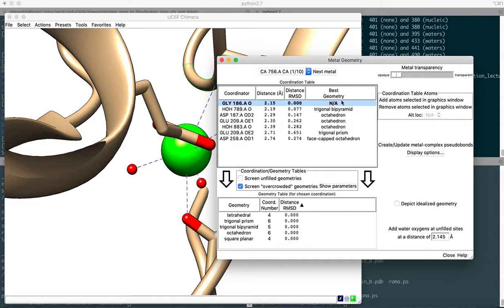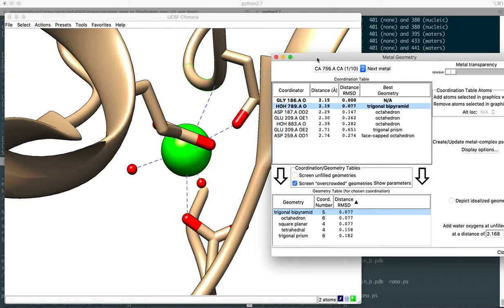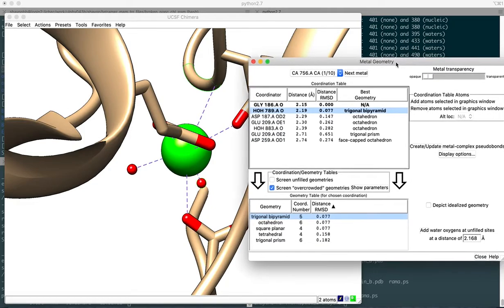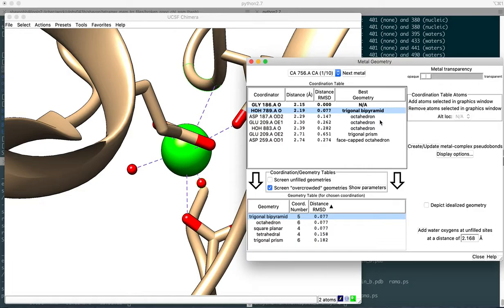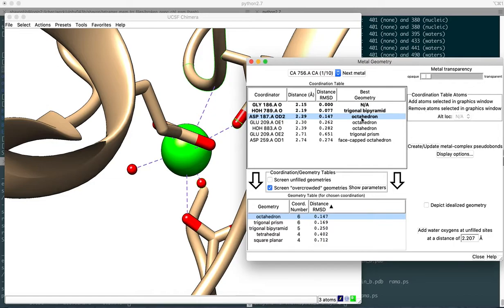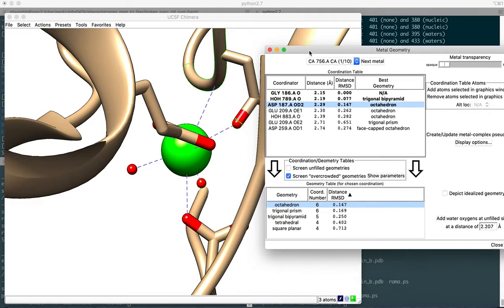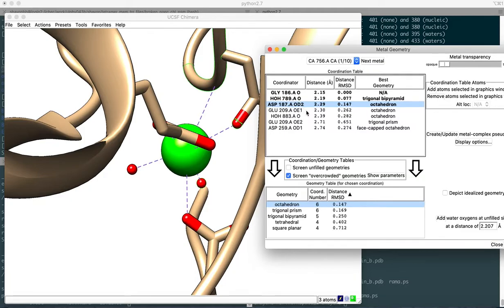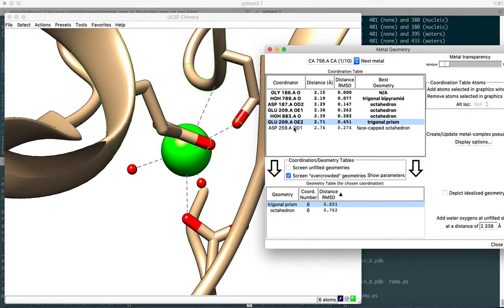Then you have the distance RMSD, which is root mean square deviation of the distance, and an assessment of the best geometry. For the first atom, that's oxygen belonging to glycine residue, it cannot determine the best geometry. Whereas if you move to the next one, which is a water molecule, including the previous selection with the oxygen atom, it finds the best geometry of trigonal bipyramid. These geometry names require going into different tables altogether. This is a different kind of geometry from an octahedron, which is the next binding site in the aspartic acid residue at position 187 belonging to chain A. This oxygen atom is forming a coordinate bond with the calcium ion.